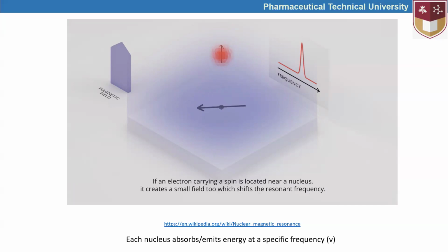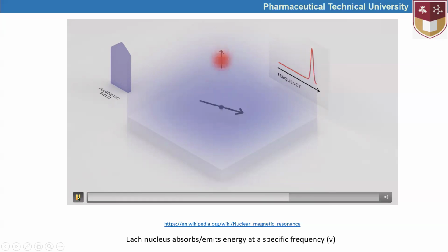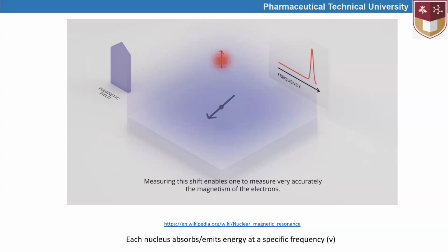Based on the electronegativity differences between the atoms that are linked with hydrogen, for example, the electron density of the hydrogen might differ, and that causes the resonance that could be observed under the effect of slightly differing radio frequencies. This is the point that determines the mechanism of the nuclear magnetic resonance under the magnetic field.